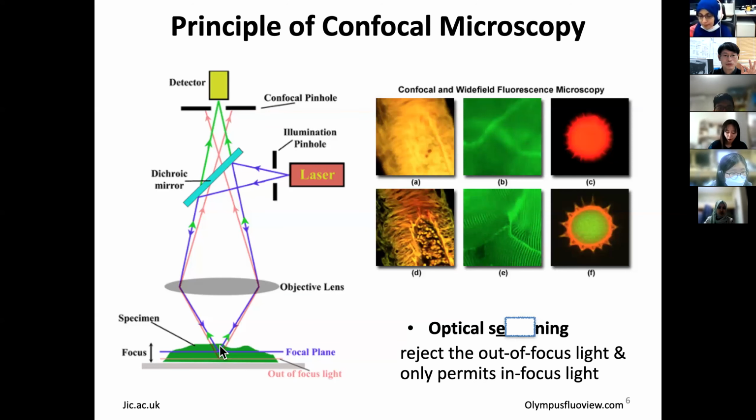So for example, what happens to the excitation from out of focus, let's say in this more reddish color one, you remember from your geometric optics of the lens imaging formula, 1 over S1 plus 1 over S2 equal to 1 over F. That means if the object location is shorter, the image location gets farther. So they move differently. So for here, it's farther here. So your focus will be earlier. And then it will be kind of spreading.